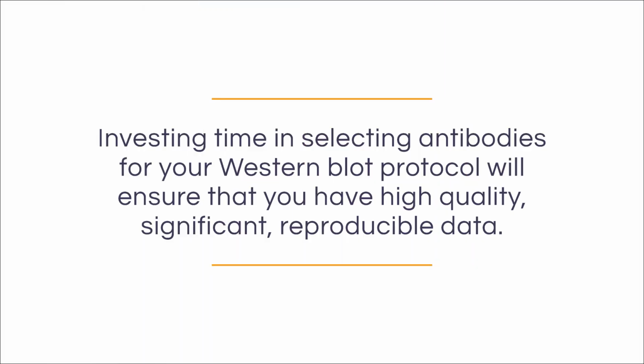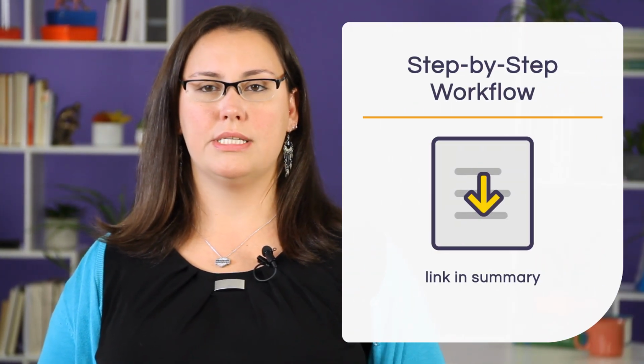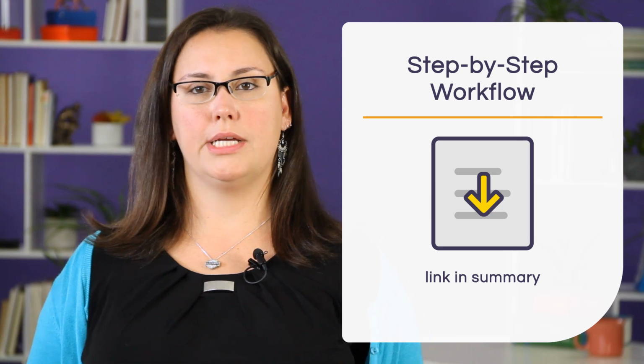So why should you invest time in actually selecting antibodies for your Western blot protocol? Because investing this time now is actually going to save you time down the line, and it's going to ensure that you have high quality, significant, reproducible data to work with. So right now is a great point for you to download our workflow so you can more easily follow this course. This is going to be the same workflow that you're going to use later on when you are selecting your primary and secondary antibodies for your Western blot protocol.